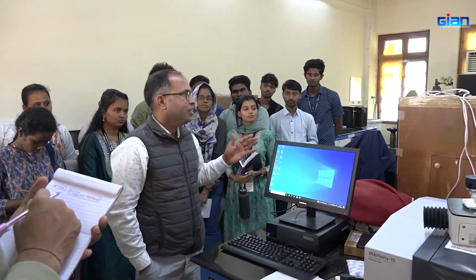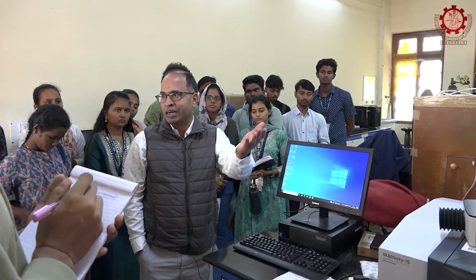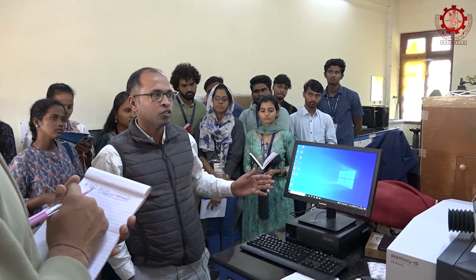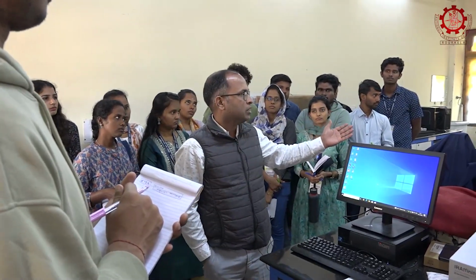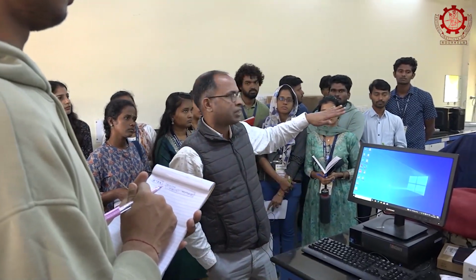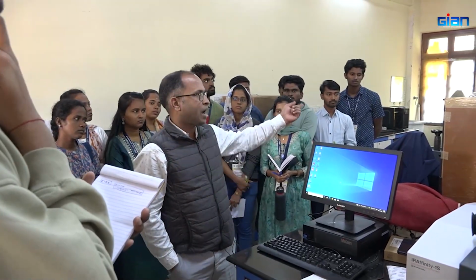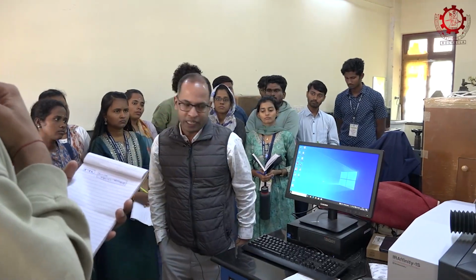You all saw that we removed our shoes, so we don't make this room dirty or dusty, because these equipment are very sensitive. That's why we try to maintain the cleanliness of this room as well as the temperature, because many of these emit heat. So to maintain the heat, we have ACs. Of course, in winter we don't need them in Rourkela, but in summer we need them.